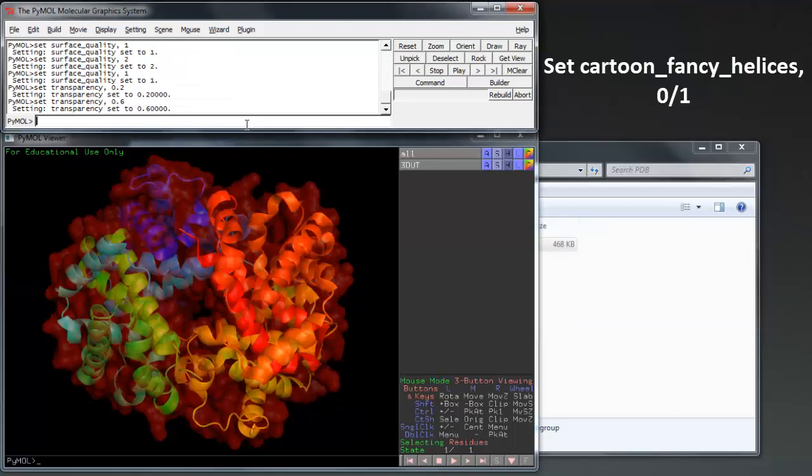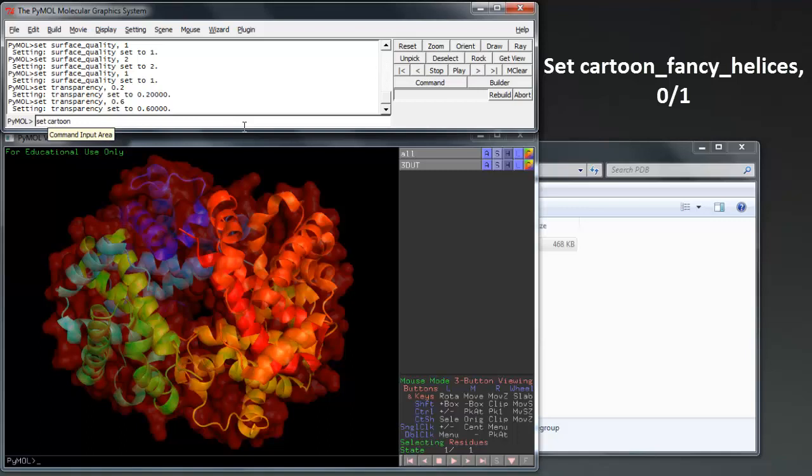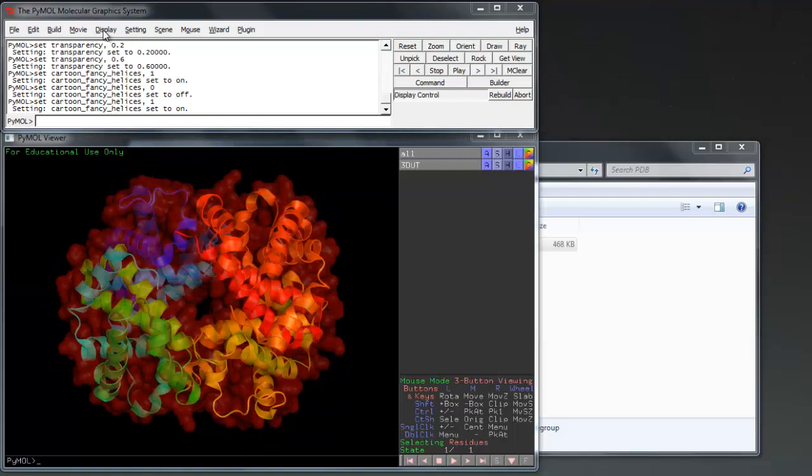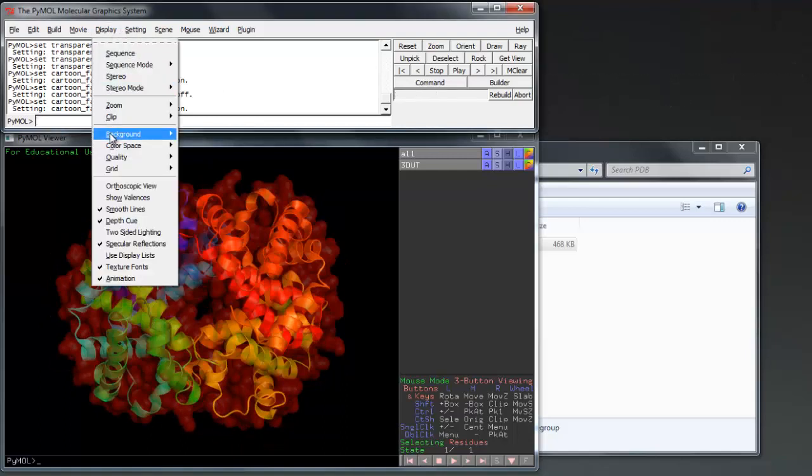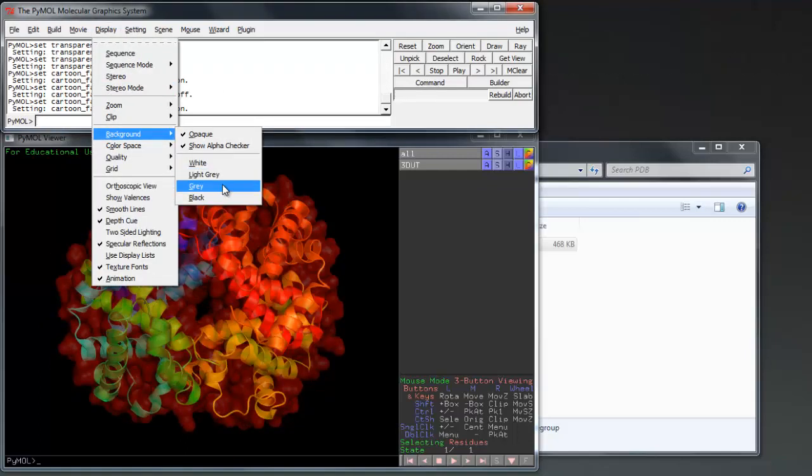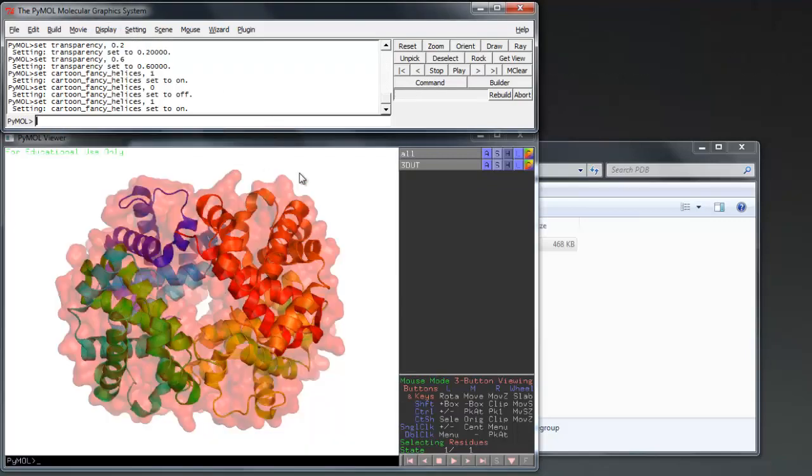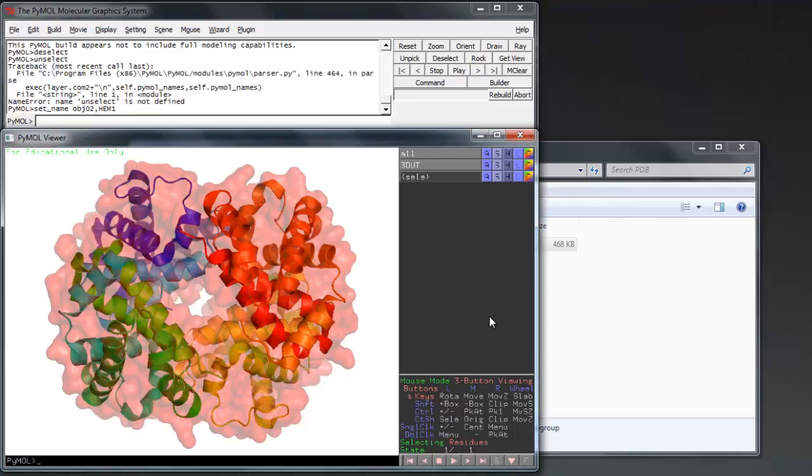If you are using cartoons, set cartoon fancy helices 1 will further define their edges. The display dropdown and background will allow you to change the color of the background on which your protein is displayed, which may make it easier to see.